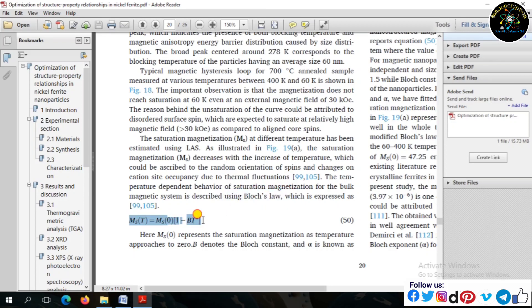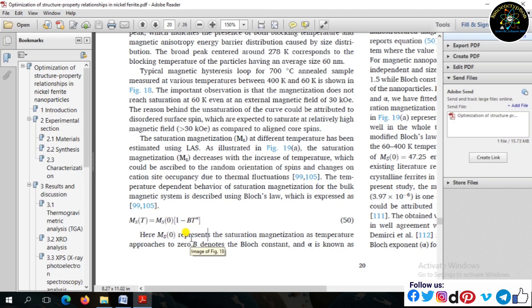This is the Bloch law equation, and I am going to fit this equation into my experimental data of saturation magnetization, which is extracted from the MH loops of magnetic data.